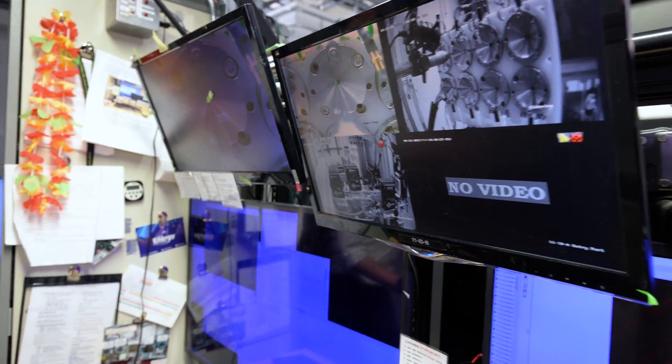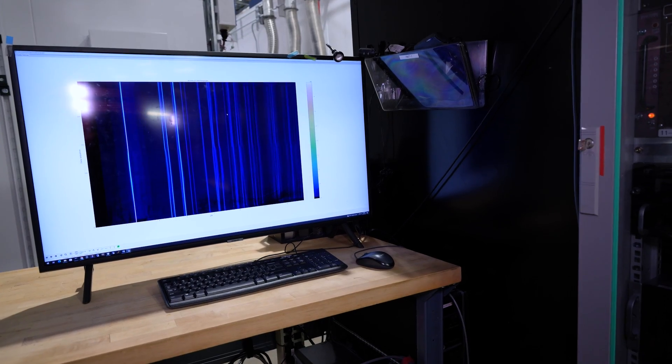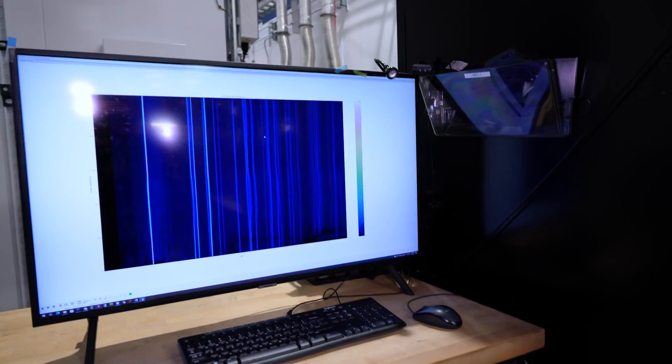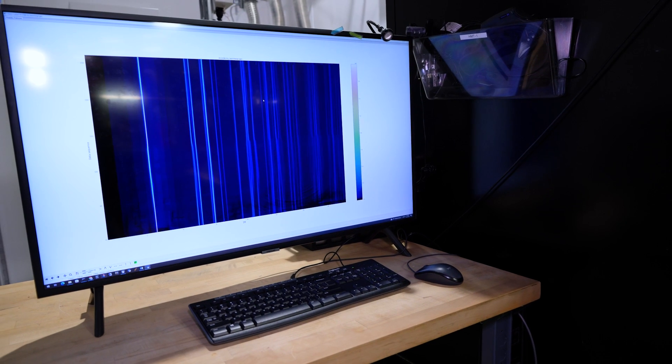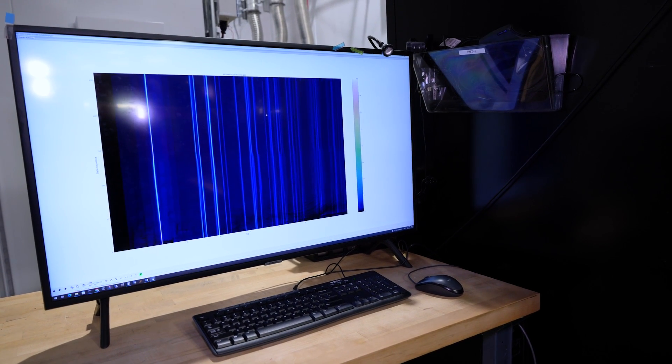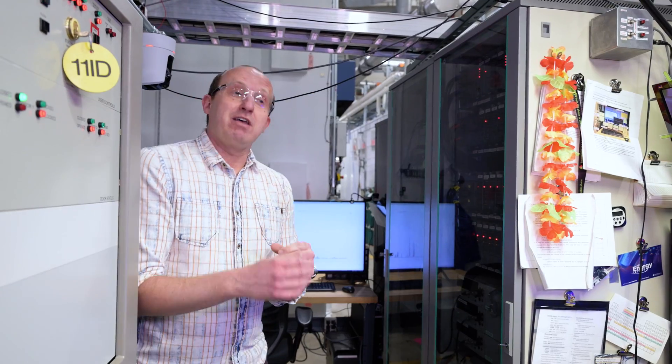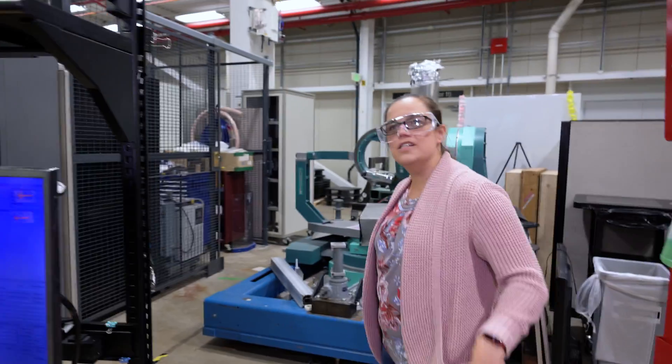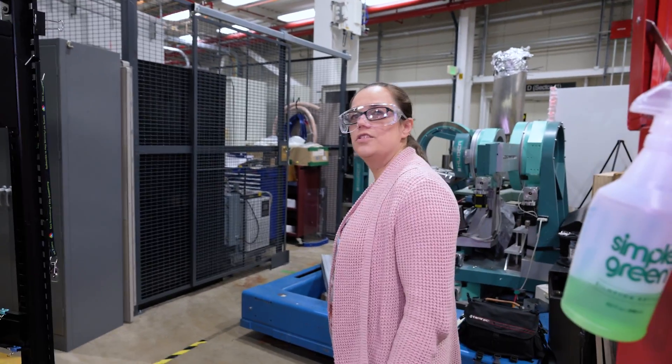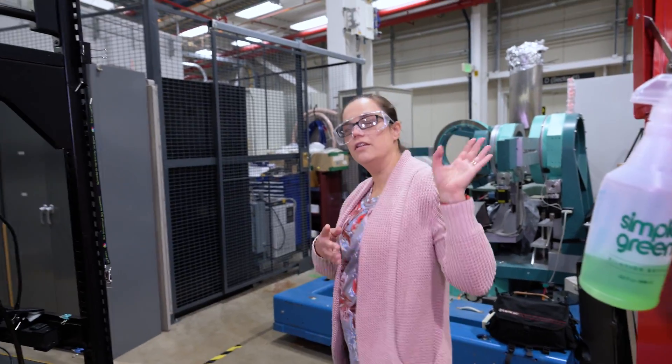We have the one that controls the beamline. That will be the last one over here we use to analyze the data. What you see here is the fingerprint of a material. Very often we stuff the battery to make sure they look better for you. All right, let's go and check the A-hatch where the X-rays are being delivered to this hatch and the other hatches.